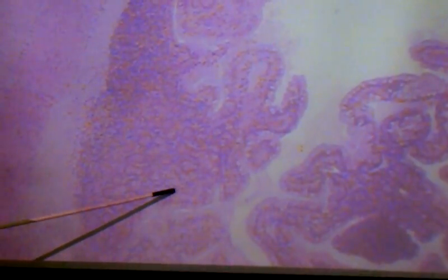For you to see. It's just kind of this general transition in density of cells and sometimes color change depending on the way the slide is stained. But we were out here a minute ago out here in the villi, and this is a villus right here, this is a villus, and then we've got one that's kind of chopped this way. And then we get into the connective tissue elements down in here. Notice how the connective tissue in here is different from the tissue here.